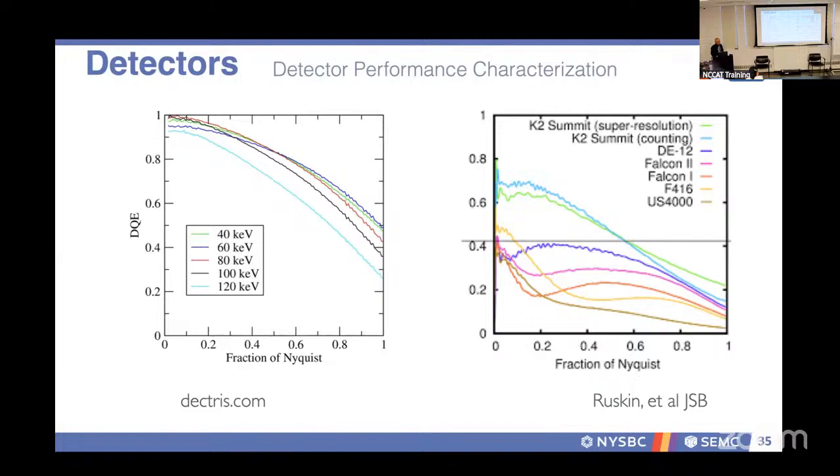So there has been a big movement to try to get more sensitive detectors at lower kVs. That's why, if you notice, a lot of microscopes, a lot of data sets are collected at 200, 300 kV, because our current generation of detectors are better at higher kVs.